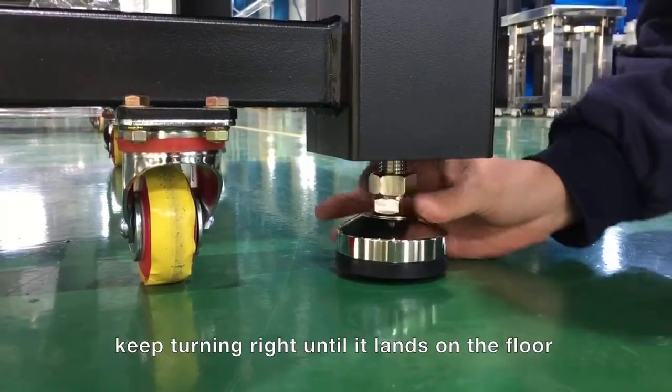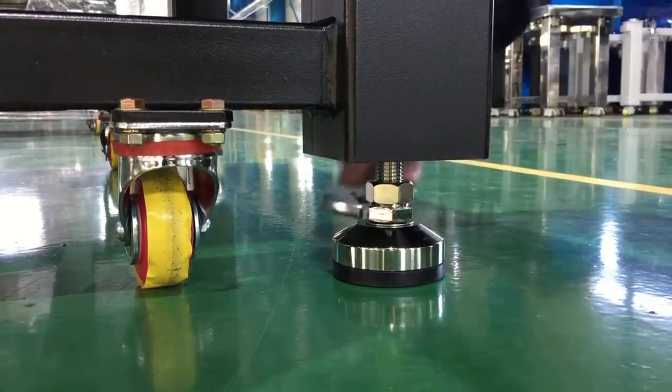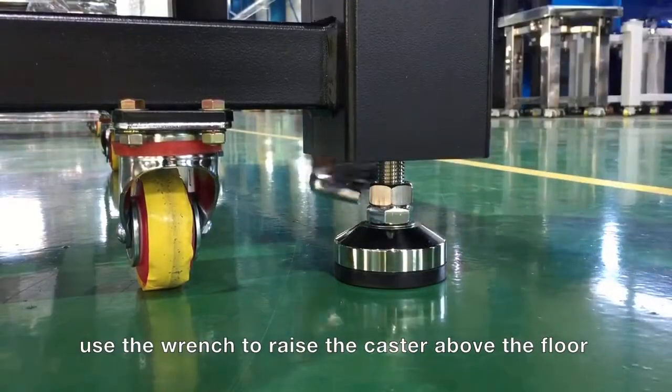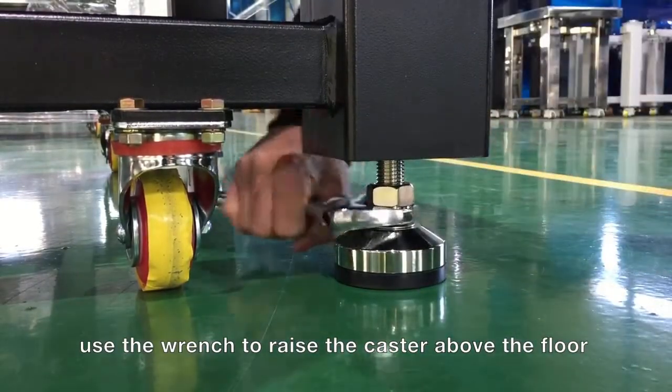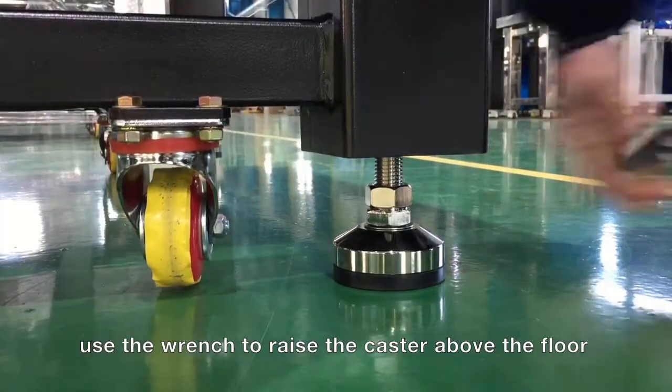Keep screwing until the feet are safely on the floor. Then use the wrench until the casters are no longer in direct contact with the ground. Repeat these procedures for all four feet and check with the level whether the plane is still ok.